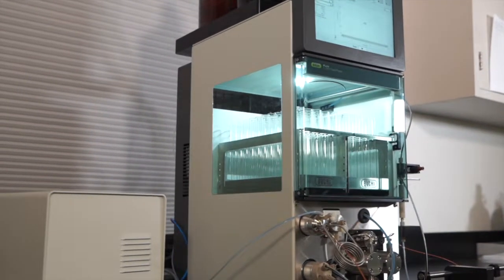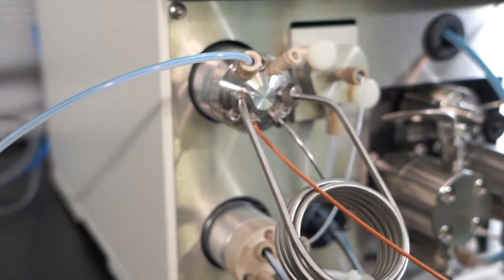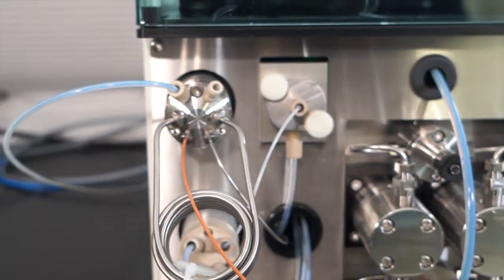The C850 features two HPLC pumps. When operating in flash mode, the pump delivers solvent at a rate of 250 ml per minute with pressure up to 50 bar. In prep HPLC mode, pumps deliver solvent at 100 ml per minute with a maximum pressure of 300 bar. Those robust pumps enable the use of columns packed with small particle size stationary phases, which run at a higher pressure.